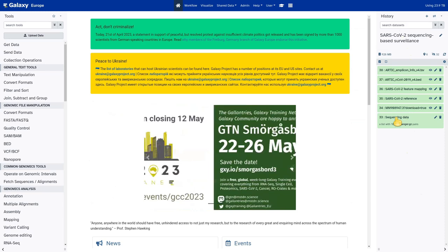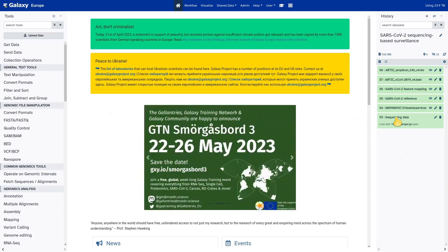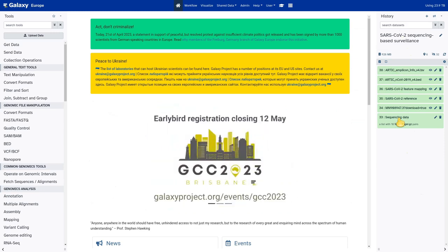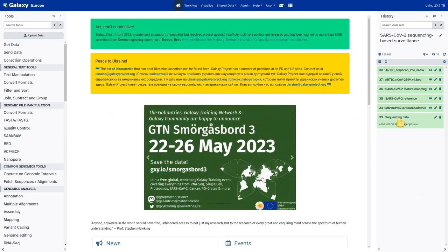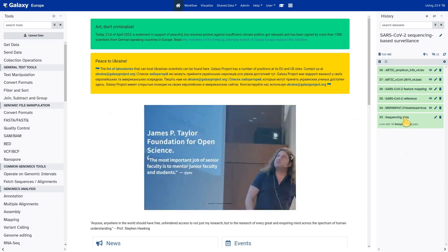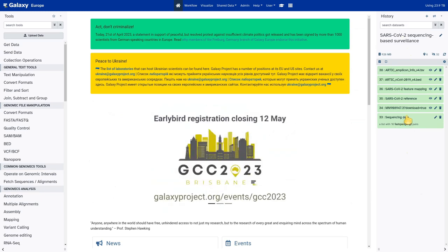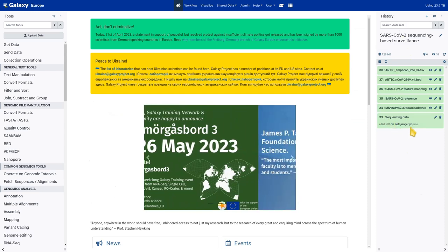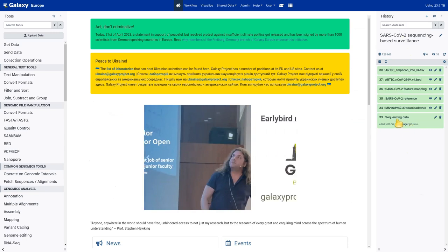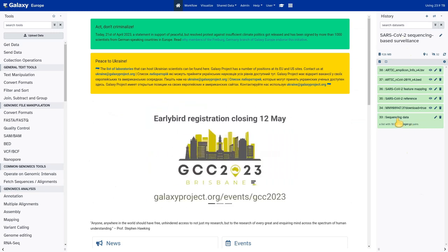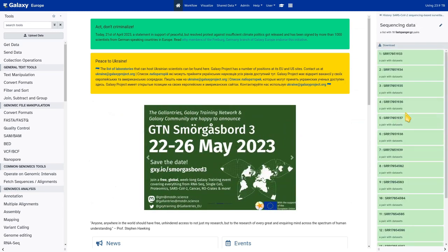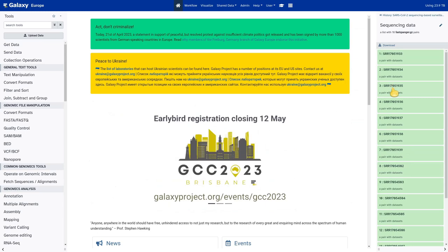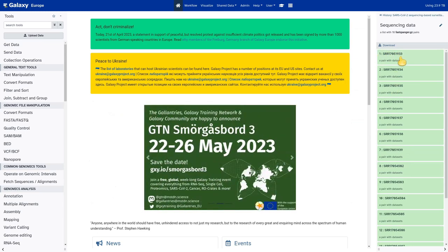I'm going with the described example data of this tutorial. We're going to analyze a batch of very early — in fact the first batch — of Omicron data that came out of South Africa at the end of 2021. We picked a subset of that batch: 16 different samples. So I have here a collection, a list of 16 pairs of FASTQ GZIP datasets — raw sequencing data that was paired-end sequenced on the Illumina platform. Stepping inside this, I see those 16 samples with their NCBI Short Read Archive identifiers as element names.